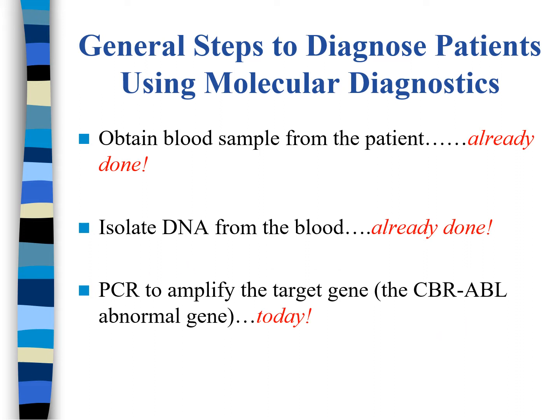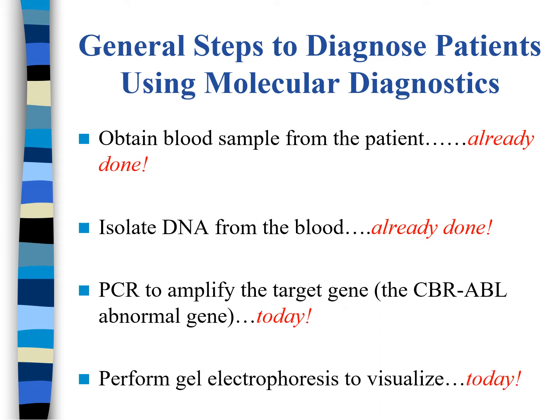And then, so we make many photocopies, but we have to use gel electrophoresis to visualize the DNA. There's a technique called gel electrophoresis that enables us to visualize the DNA under UV light.